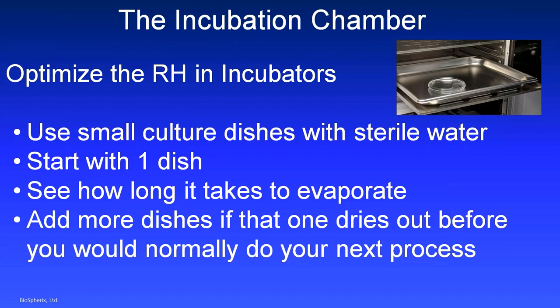So it's a good idea to optimize how much water you're bringing in to increase the humidity in your incubation chambers. What we suggest is that you start off with one little culture dish with sterile water and see how long that takes to evaporate. Does that last in between times that you need to be doing your cell handling or cell passaging or whatever you do with those cells?